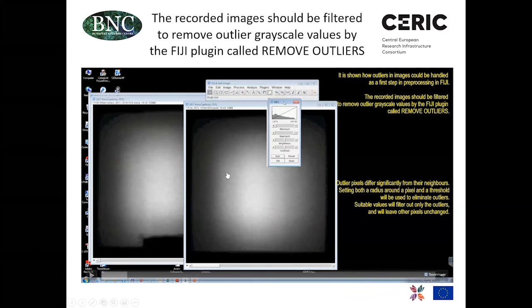In this feature, you can manipulate the brightness and contrast of the images without touching the numerical data. It is only relevant for the display, and you can change it anytime. By increasing the lower end or decreasing the upper end, you can enhance certain regions of the image where you want to focus.